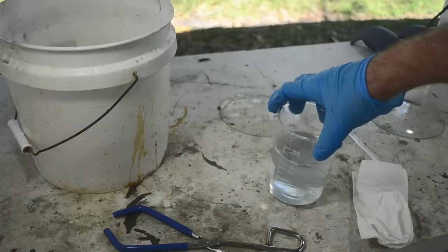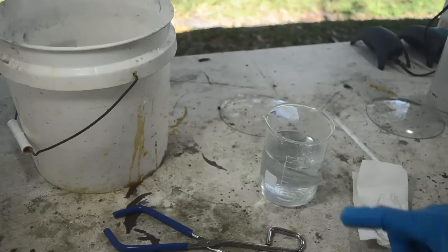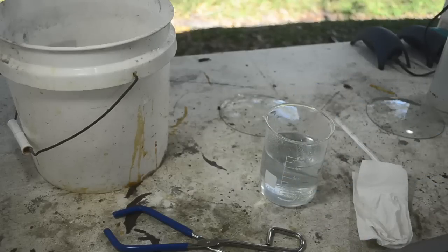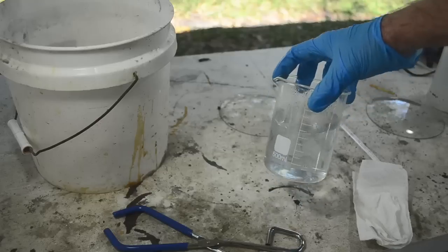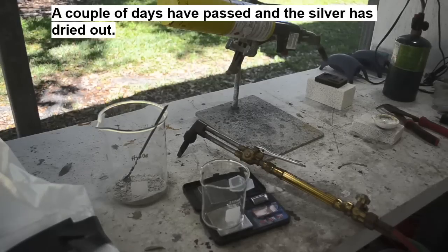And the easiest way I can think of to figure that out, because this is still quite warm, is to put this in the fridge and get it really cold, because silver sulfate is not very soluble at all in cold water. So if there's any silver sulfate in there, we may see a precipitate. So I'm going to put that in my lab fridge and leave it for a while, and we'll see if any precipitate forms.